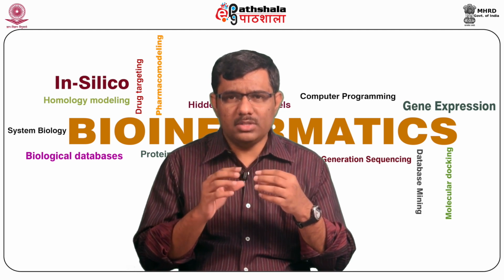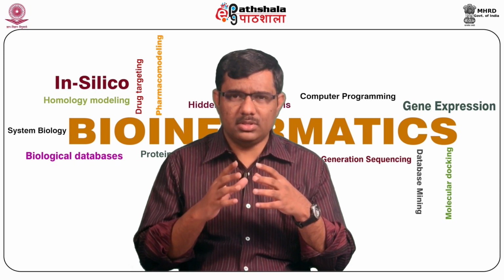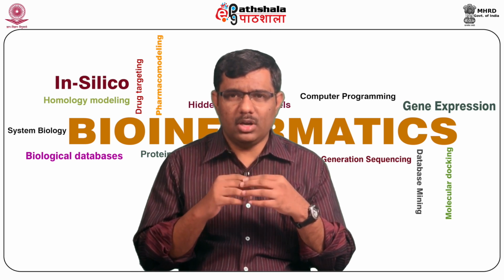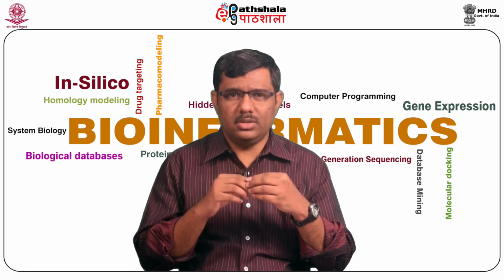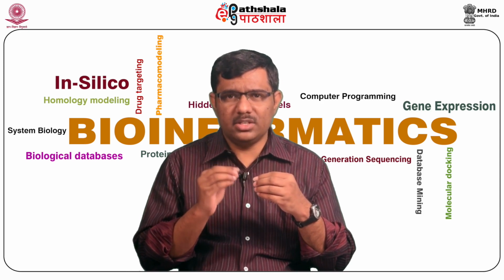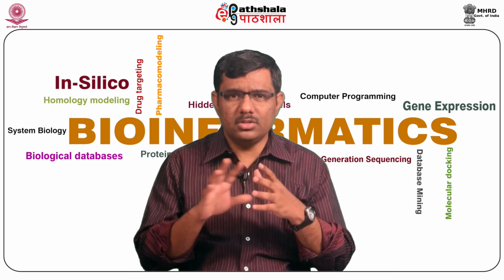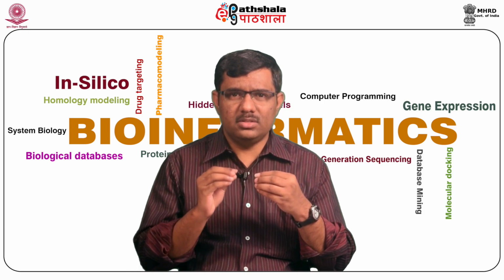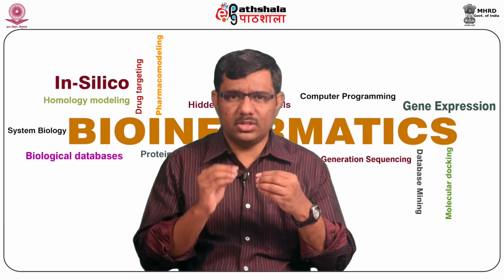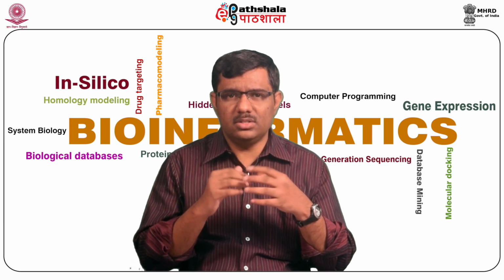So we can't always believe programs, because they often mislead. Sometimes they provide wrong observations also. So there is a difference between mathematical calculations and biological interpretations. The mathematical statistics should be correlated to the biological functions, because computers don't do biology, they do mathematical sums. Hence the researcher should interpret the structure with respect to the biological function rather than the statistical significance.